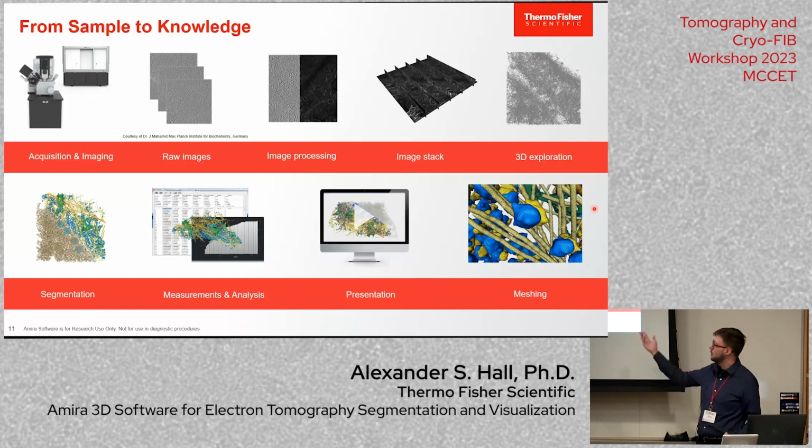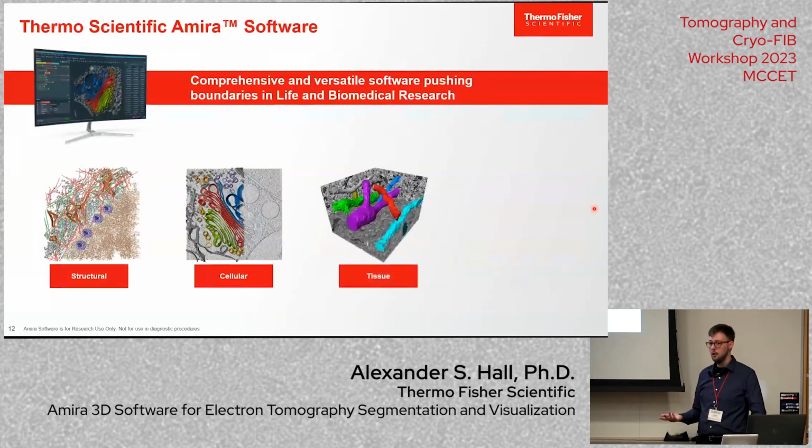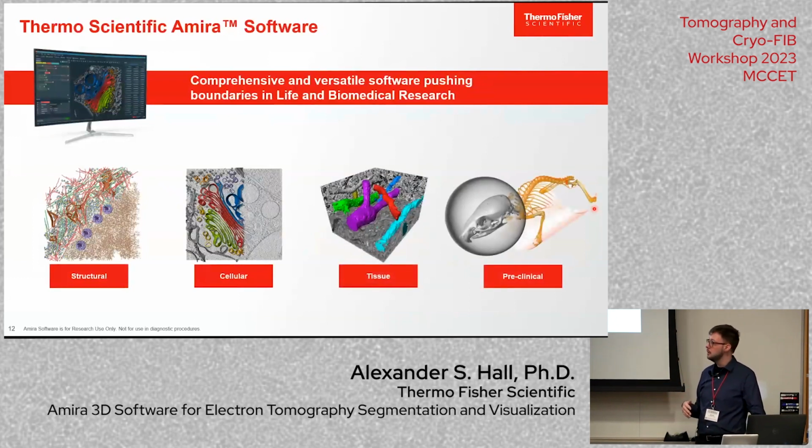And it shows meshing down here as someone else's slide. I don't know if you'll actually ever do that, but definitely the measurement and presentation of data is all done within Amira. Now, the application itself is not specific to cryo-electron tomography, which I think is a strength for people that are doing any correlative work, or if you're ever in the future doing imaging work that's not cryo-electron tomography.